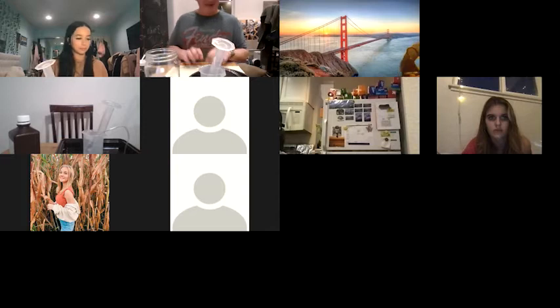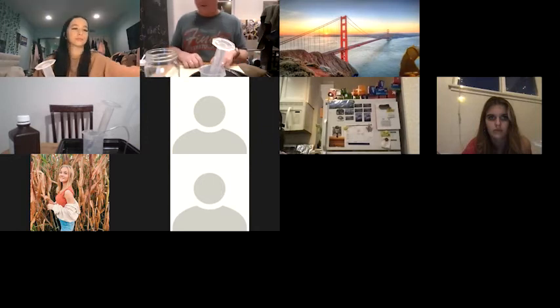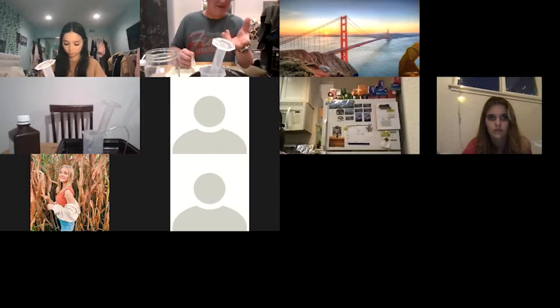I might figure out a way to cover it with a piece of saran or something like that. Cover it with saran and then turn it upside down and put it underneath. That might be a better way to do it. You might want to try that. Because even if a little comes out, like 1 or 2 mils, 3 mil, that's fine. But if half of it dumps out, then it makes it real tough to measure the amount of O2.